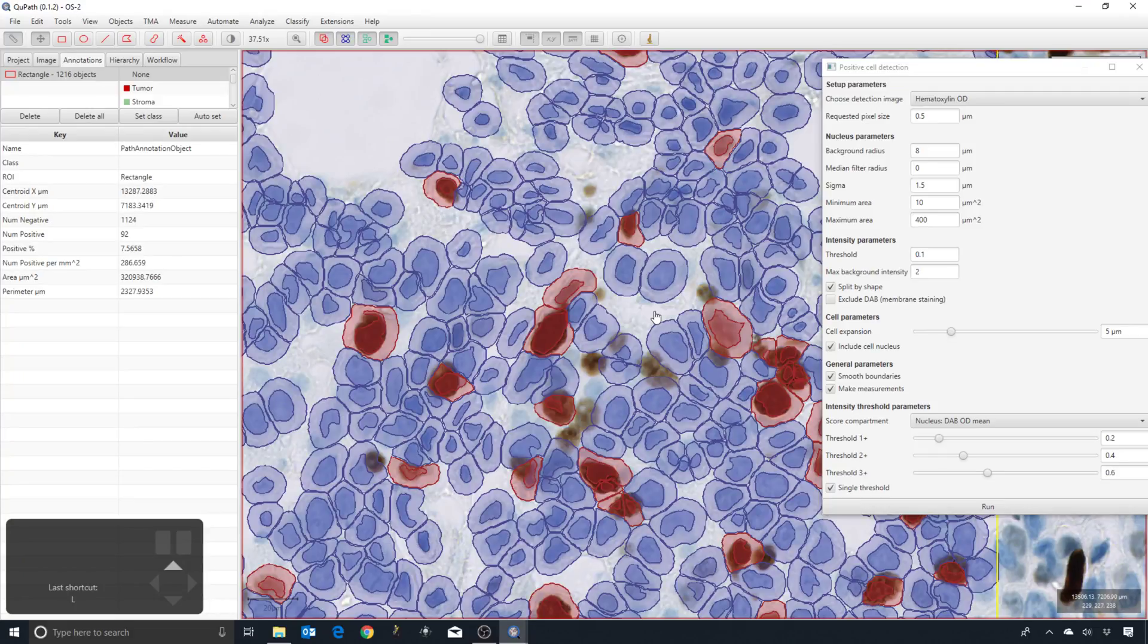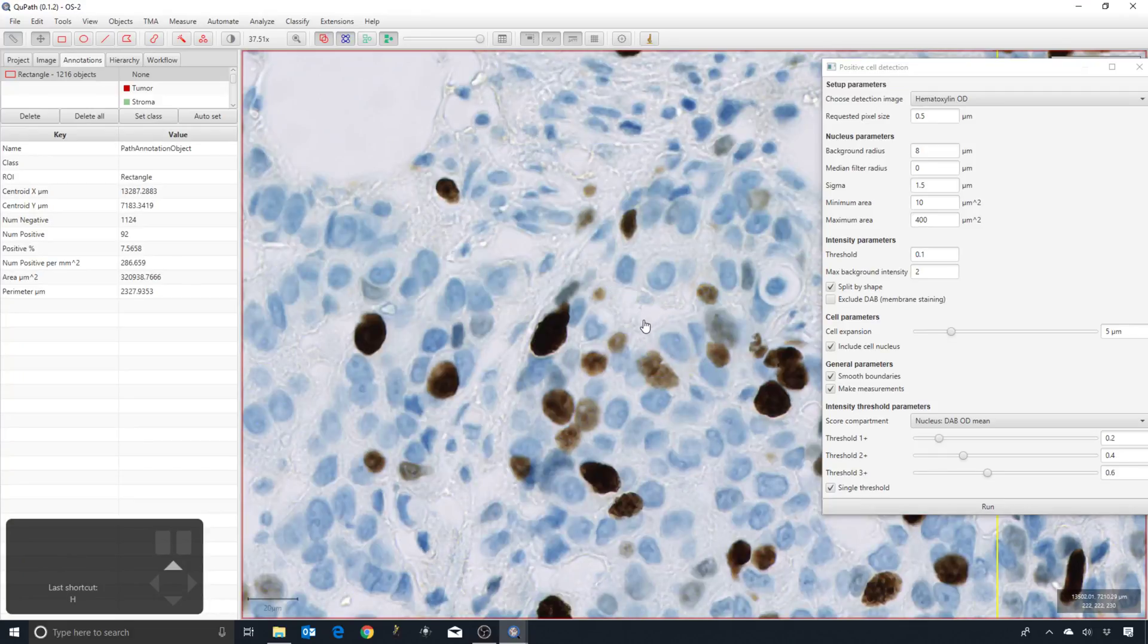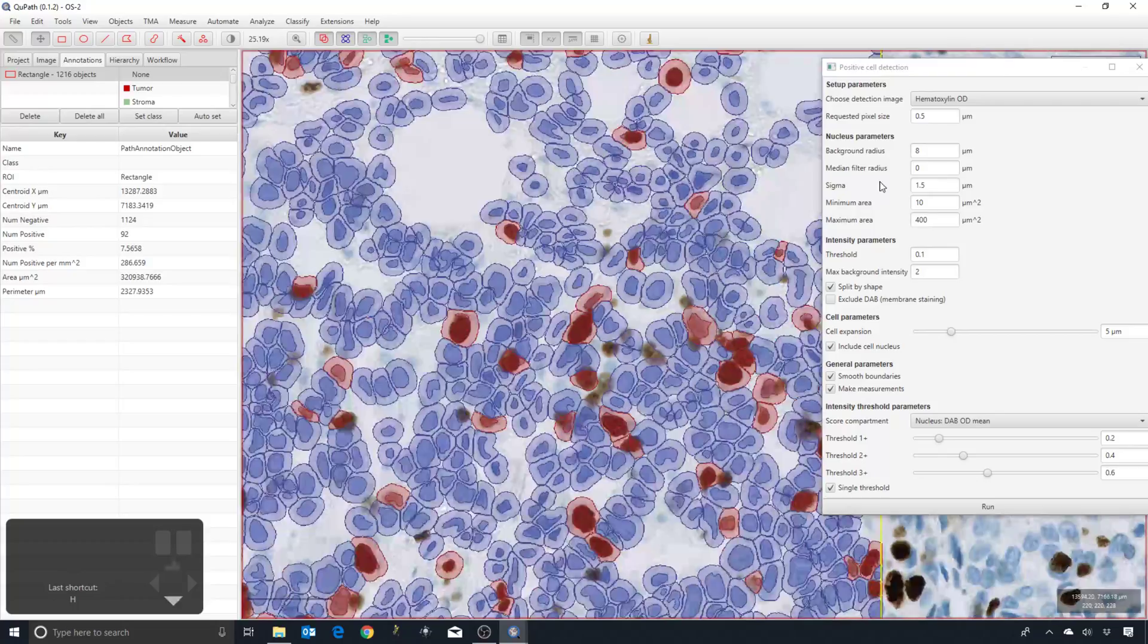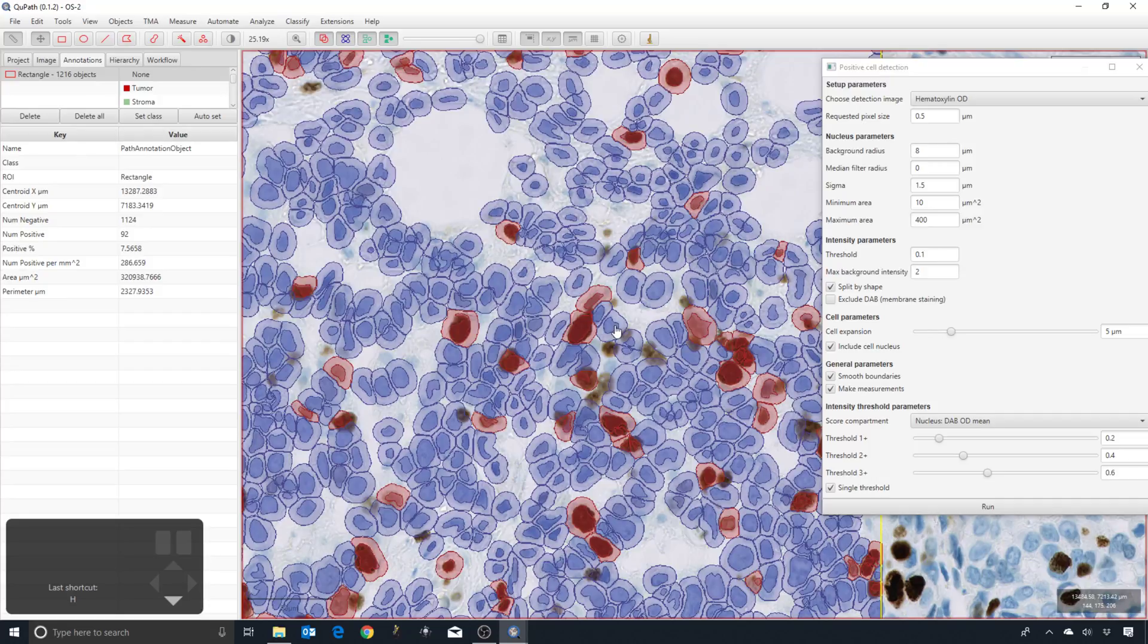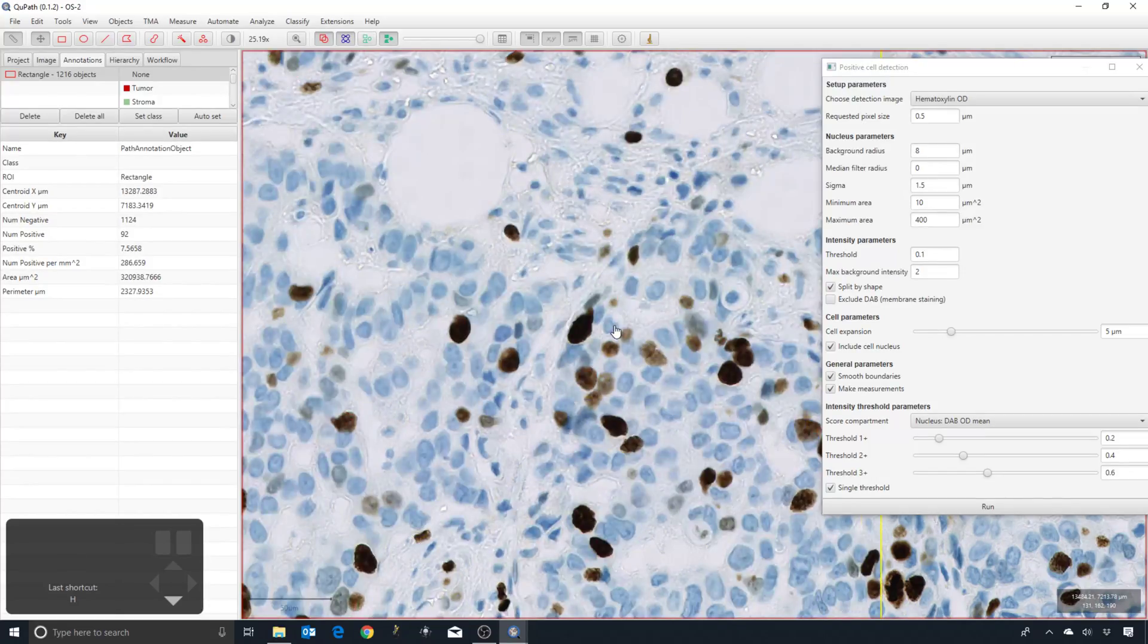Right, so what I would now like to do is try and make this better. To do that, we're going to explore each of these different parameters here and see what effect we get from changing them.